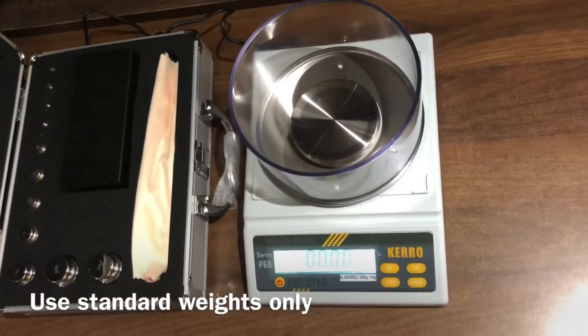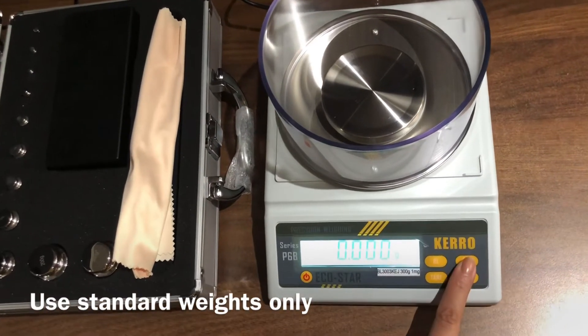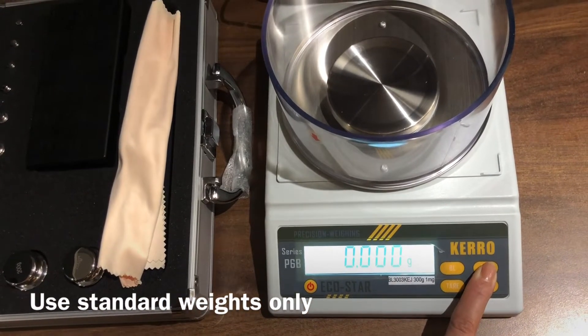Make sure the weighing scale is on a very stable platform. Once the display shows zero, press the CAL button to enter the calibration mode. Keep pressing it until it shows D6.